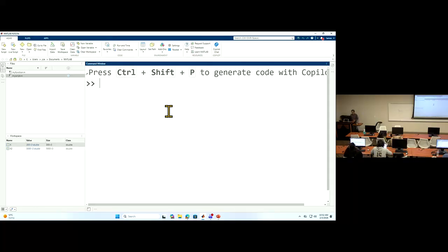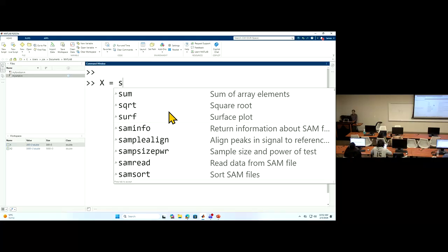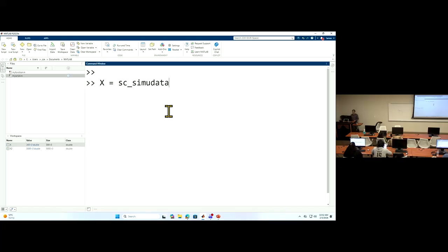Okay, so we finish this part now. I'm going to simulate real single-cell simulated data. This is a real function. What you had is just a toy. You simulated 3 genes, with the number of cells you define.